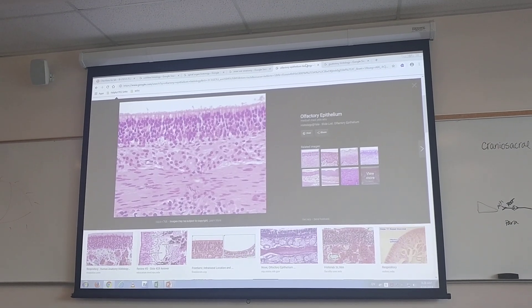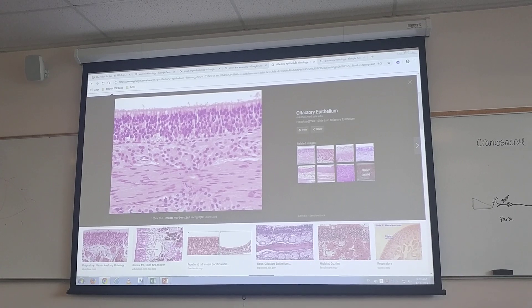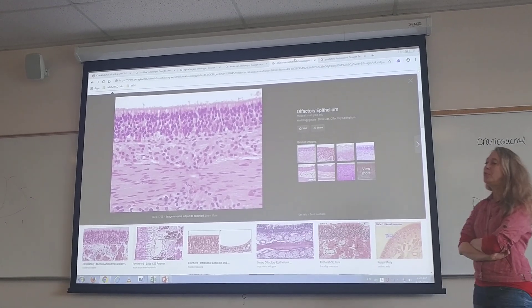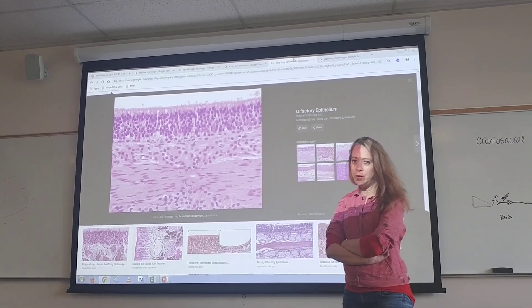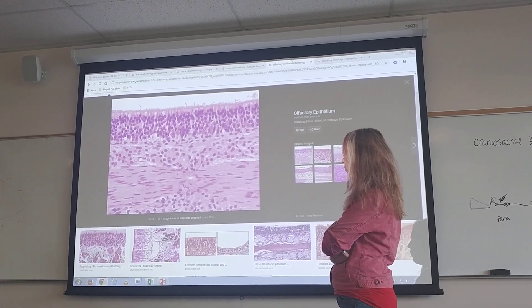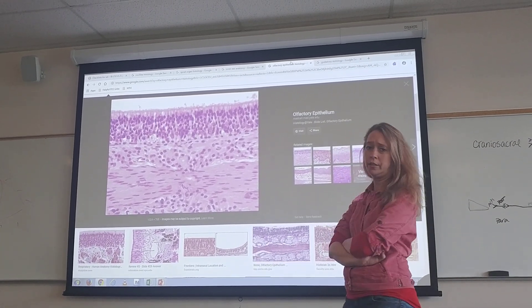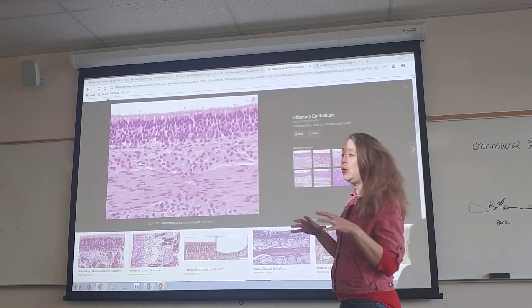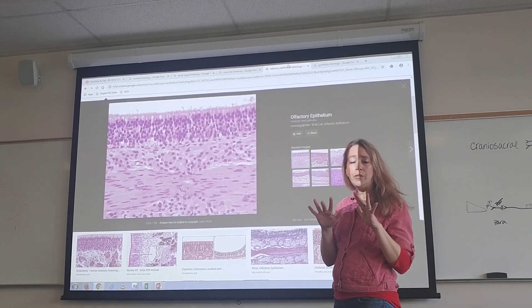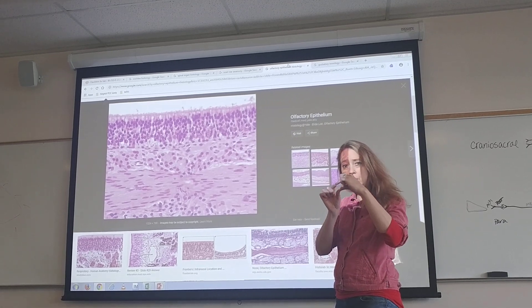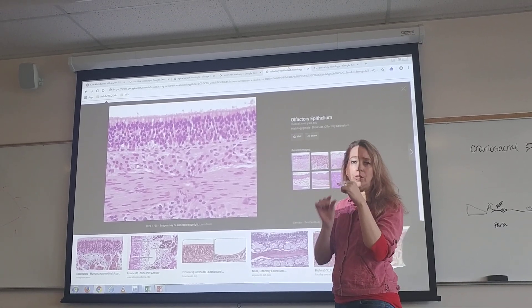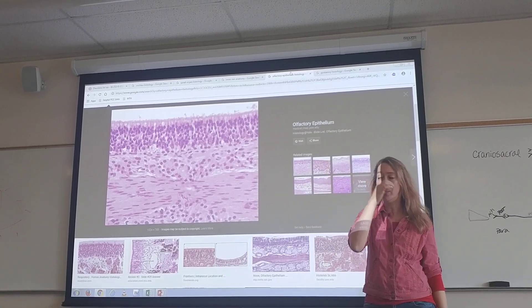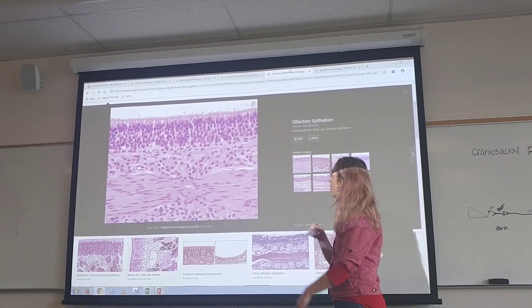Next we're going to look at olfactory. The olfactory epithelium is PCCE — that's what you're generally looking for with olfactory. You can see up there the shag carpet at the top — those are actually the chemoreceptors, the olfactory receptors that are going to be detecting the odorants of smell.